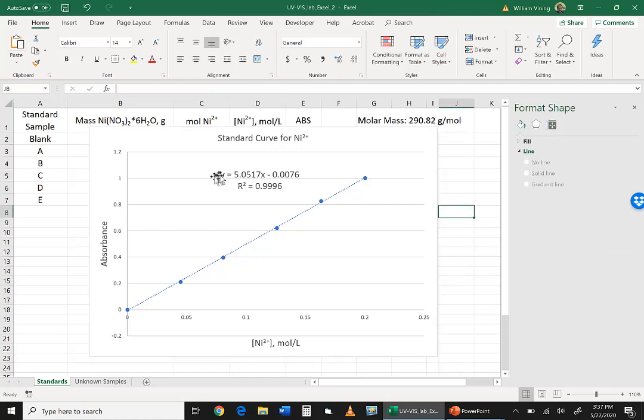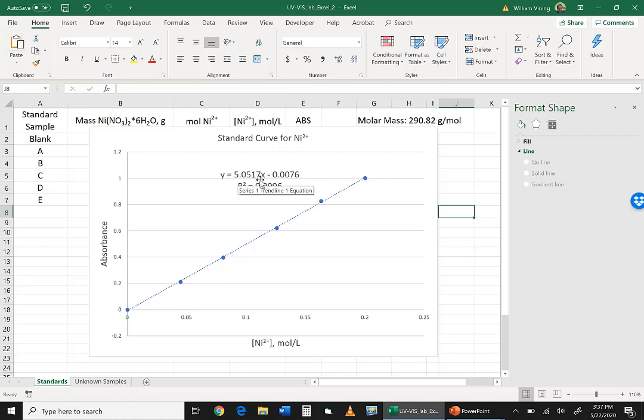And the equation we have is y, which is absorbance, equals 5.0517x. x is the concentration of nickel, minus a small correction factor because the line didn't quite hit 0. But that's looking really good. So now we're going to use that equation to calculate the concentration of all of the nickel 2+ in all of our unknown samples.